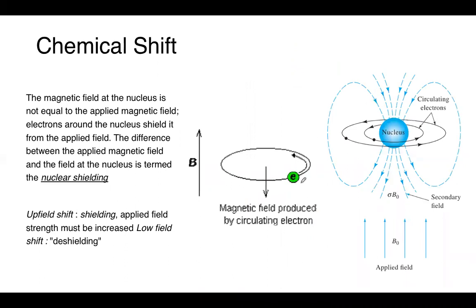The chemical shift. So this is the peak position, basically. We talked about the idea that chemical shifts and peak positions are going to be important, because that's representative of the sample that we have.